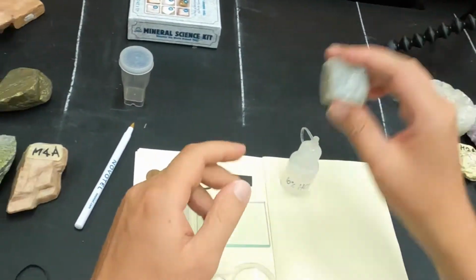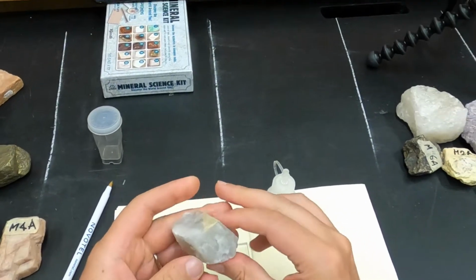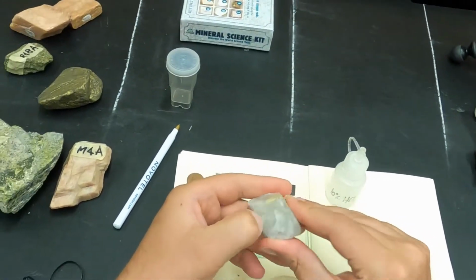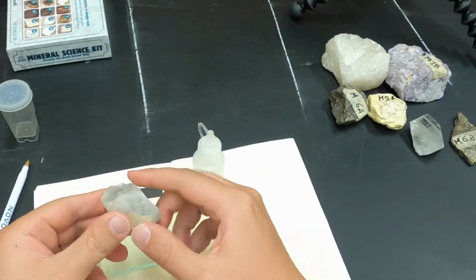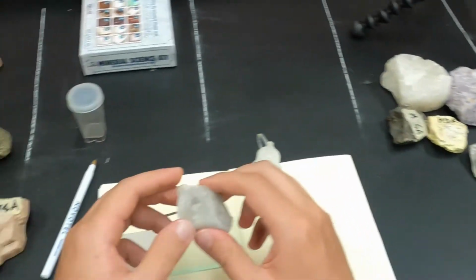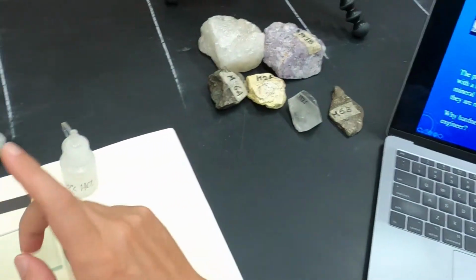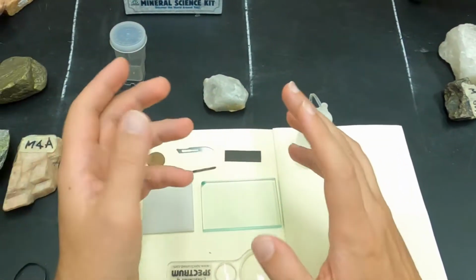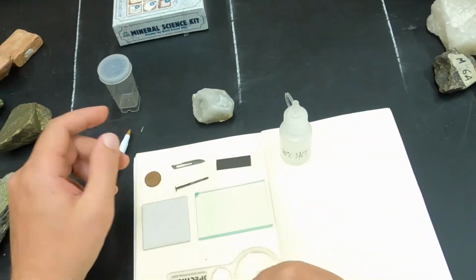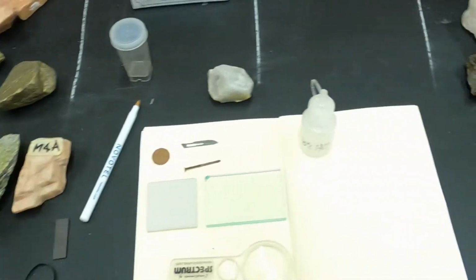So we could take an example here. I can try to scratch the faces of this crystal and see that it doesn't really work. I cannot, in this case, scratch it. So this is how you do it. You try to scratch the surface. The fingernail is the softest, on the order of 2 to 2.5, and then you go up in terms of strength. The magnet is not used for hardness.